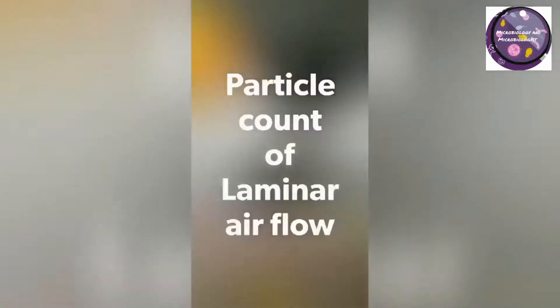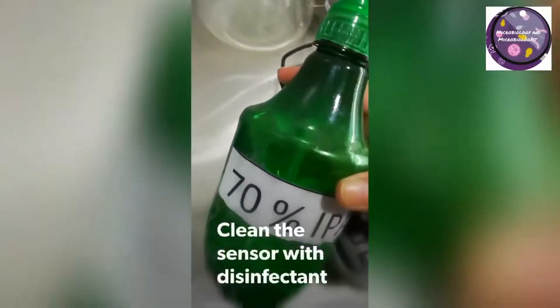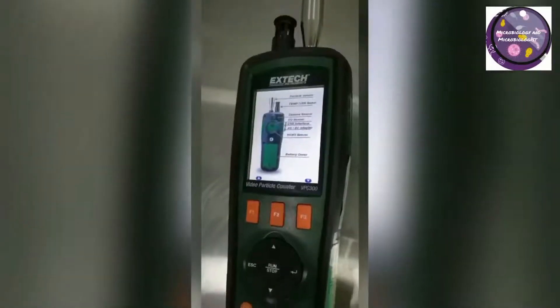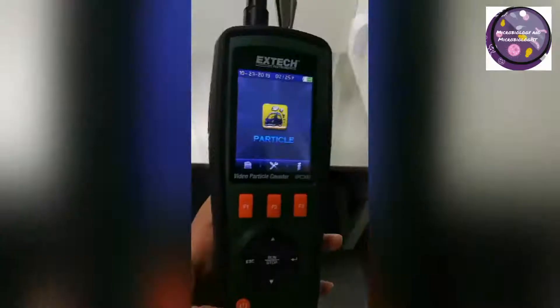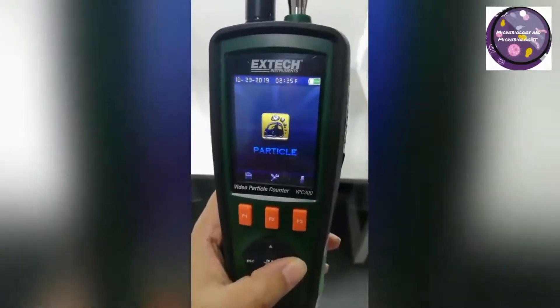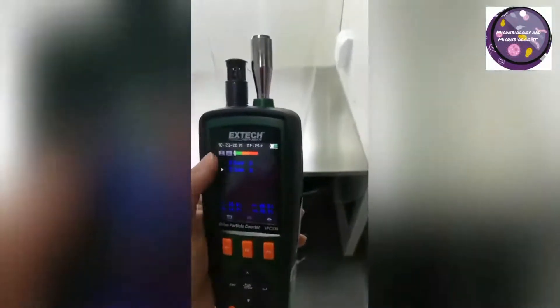Now for particle counting, first clean the sensor with a clean cloth and disinfectant so that any irrelevant particles will not be triggered during the particle count. Turn down the temperature and humidity sensor as well. This is a description of the particle counter and I will demonstrate with my X-Tech particle counter.